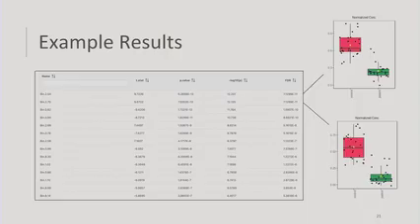Our results from our simple analysis are just going to be a table like this. Each row is a metabolite, and then you can see the t statistic, the p-value, the negative log 10 of the p-value, where a higher number is better, and then the FDR, or the adjusted p-value. I'll explain that as well later. And just like the one that Chung showed earlier, all of those have a little visualization button so you can see the individual plots.